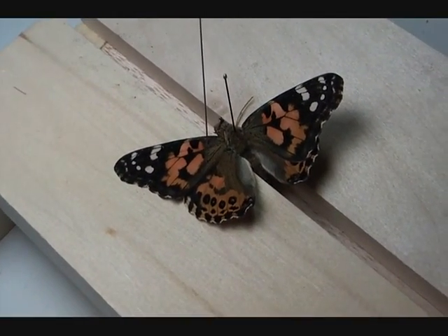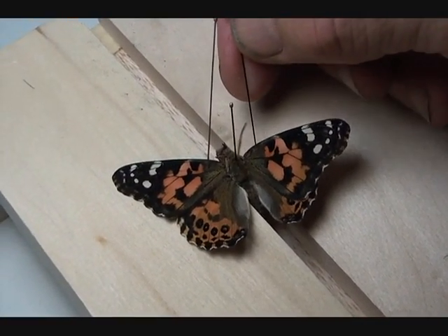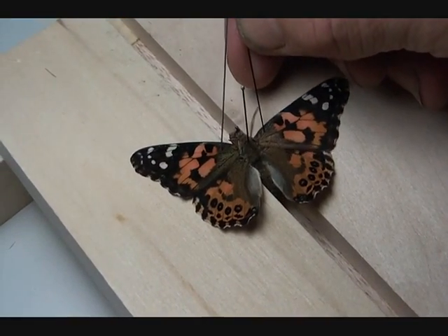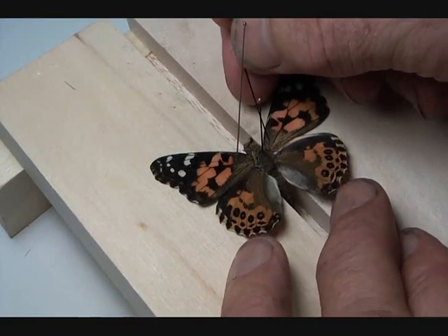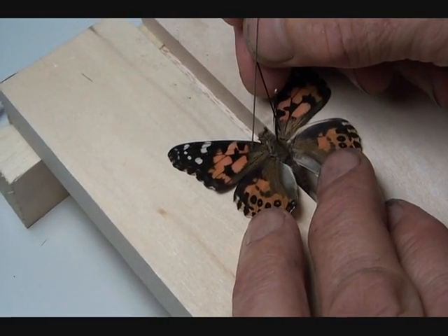Then go after the other wing. Again, pierce right behind the subcostal vein and bring it forward until it's right opposite the first one.